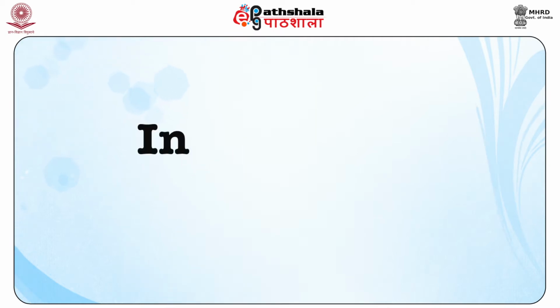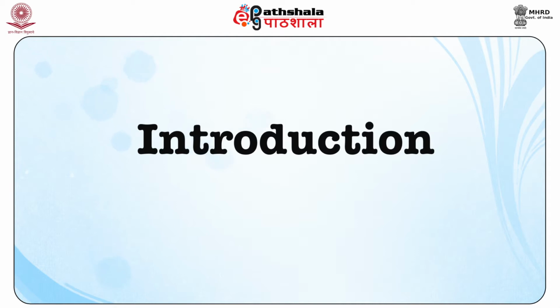Mass spectrometry is a powerful and fast technique in the analysis of proteins and peptides, although at present very large proteins cannot be analyzed by this technique. Let me introduce you to this major technique.